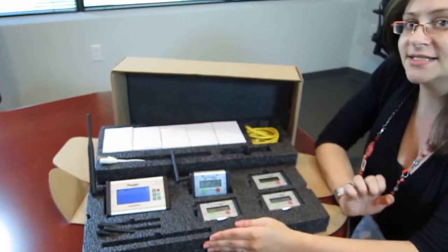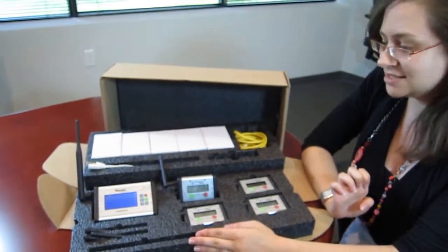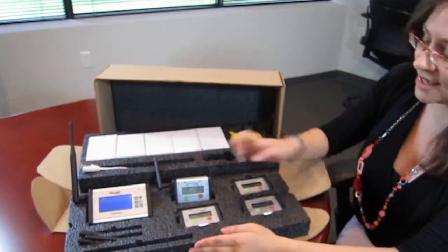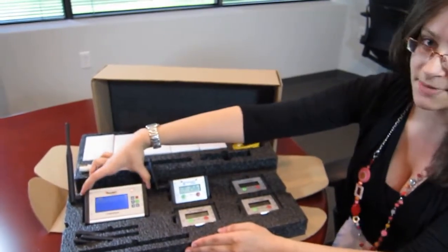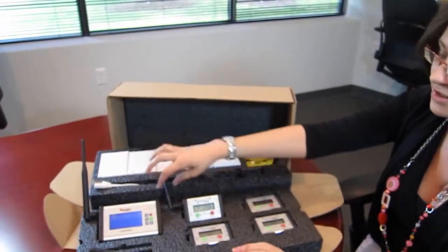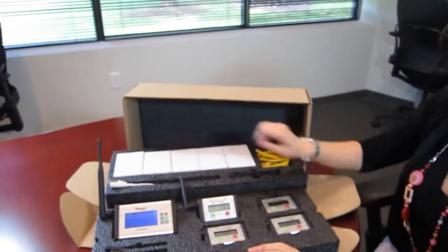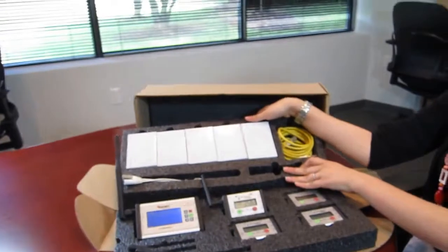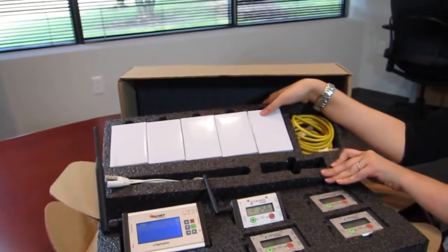When you order the X-Tag Display and the X-Tag 2 for the Star Kit, what you will have is one display, and then you will have up to four tags, along with their antennas, right there, all the cables that are required to install the kit, and the power supplies.